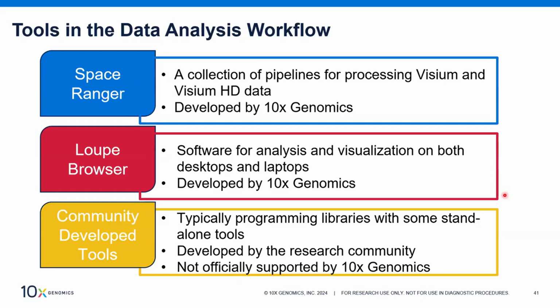This could be a server, for example, or a cloud service. This is a Linux-based command line system. So you will need a lot of coding. Nah, you don't need a lot of coding. You just need to know how to work with these command line pipelines for processing the Visium data.